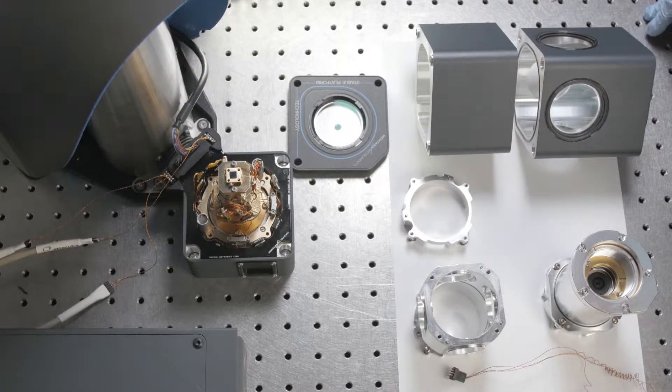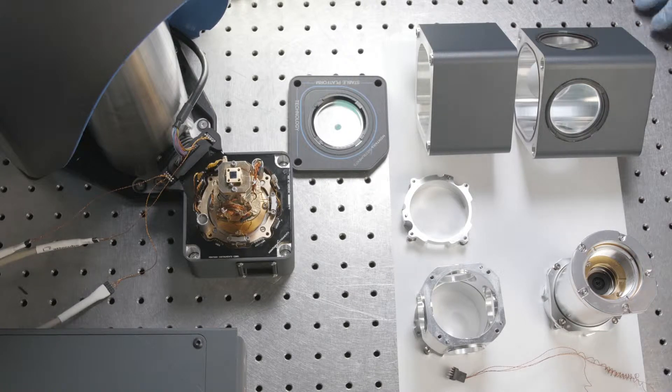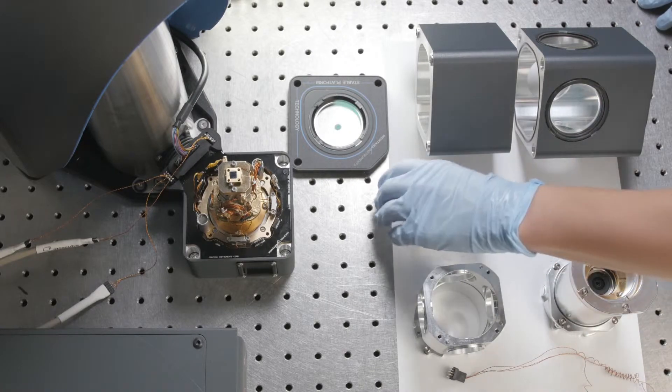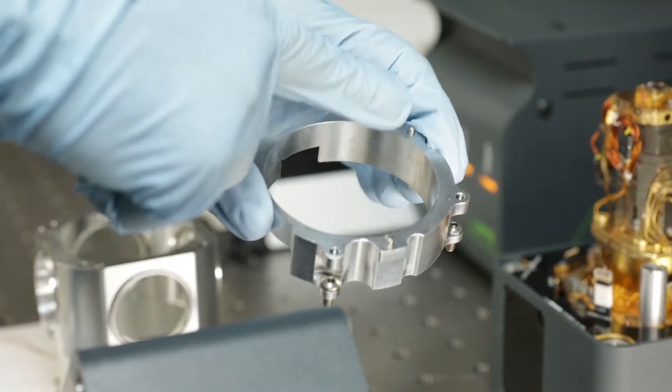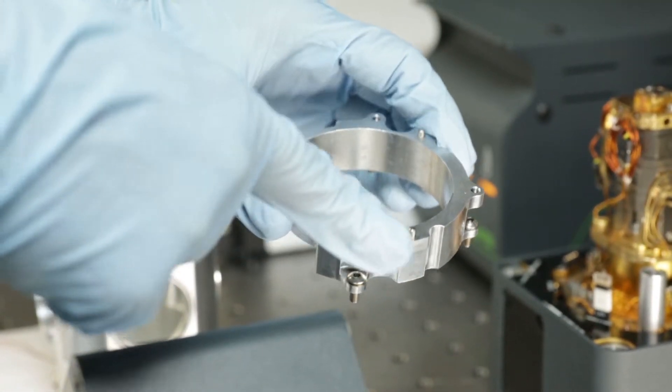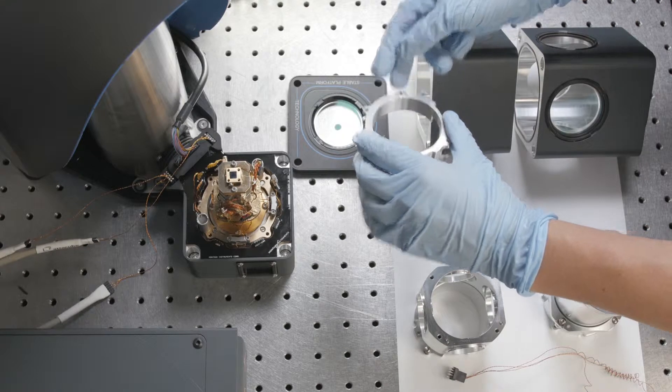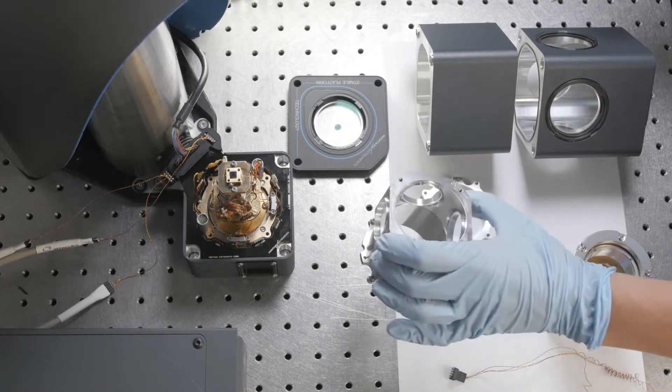Now I'm going to assemble the cryo-optic into the sample space. I'll start with the base radiation shield, which has pins so when you put it back on it'll stay aligned each time.